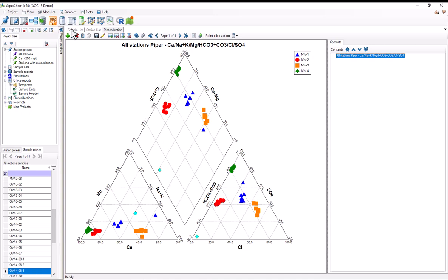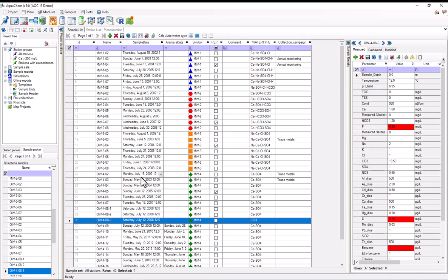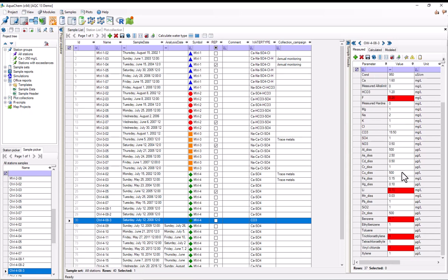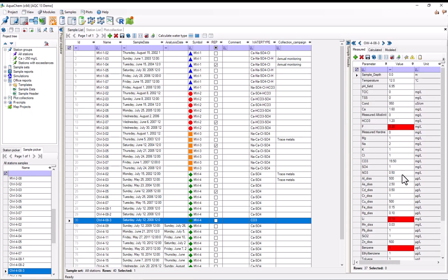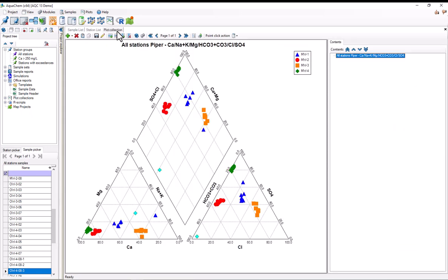Now, if I go to the sample list, we can see that this sample has been automatically selected and I'd be able to review the chemistry data for the sample. So, I'll go back to the plot collection.